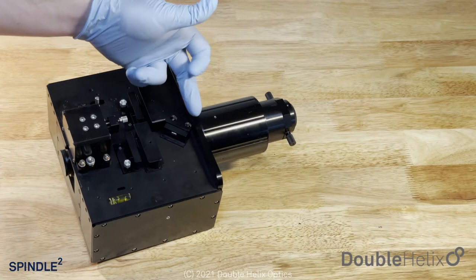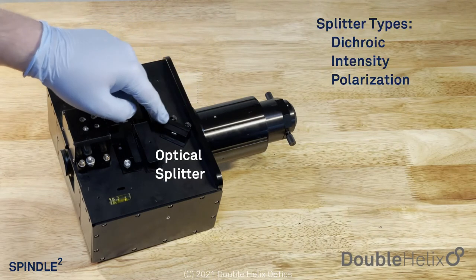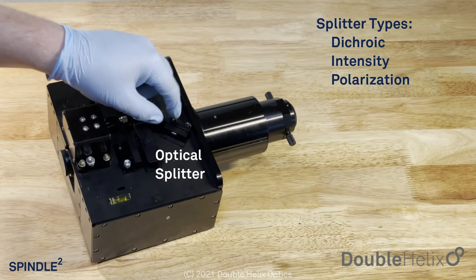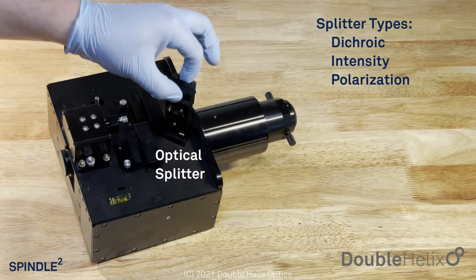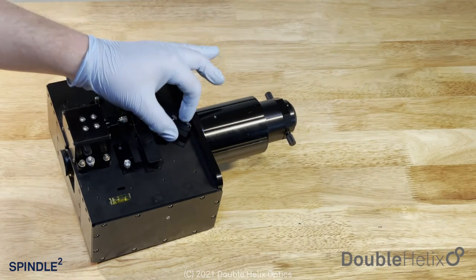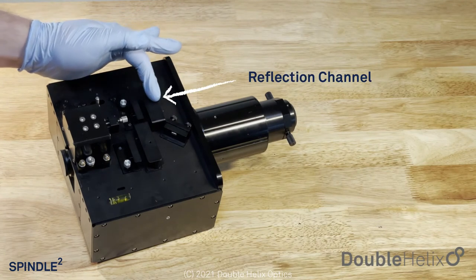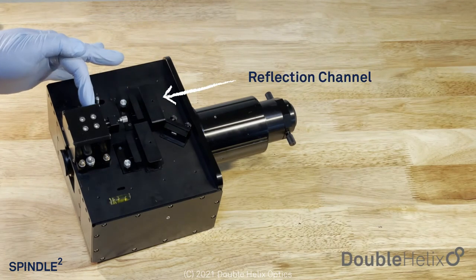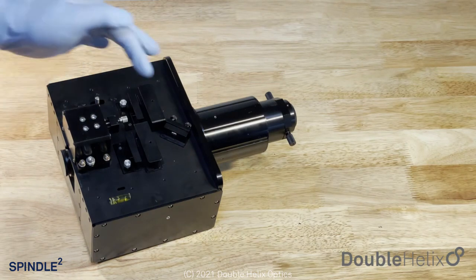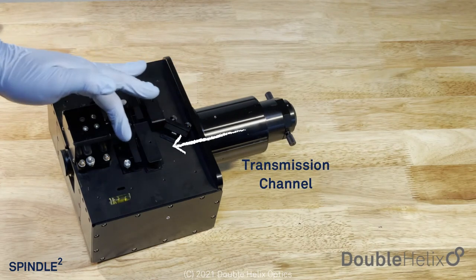We're in two-channel mode right now, so this is our splitting optic. This can be a dichroic, an intensity splitter, a polarization splitter — whatever we want it to be. It just clicks in with magnets and back in nicely. We then have our reflected side, which comes down this side of the Spindle Squared into our combiner optic, which then goes to the camera. We have our transmitted side here, which does the same — comes down and goes into the camera.